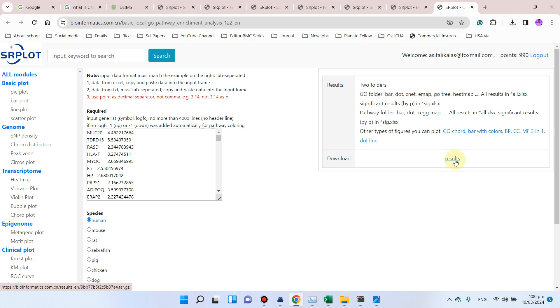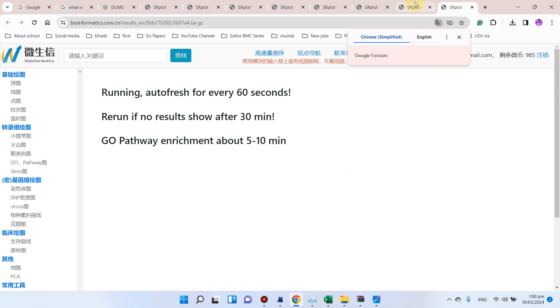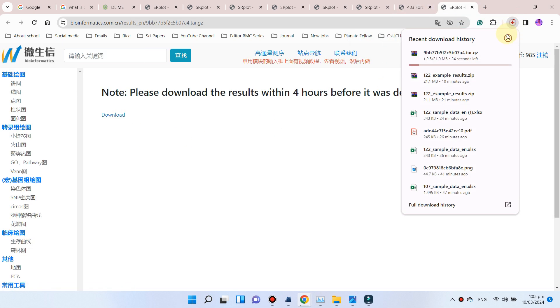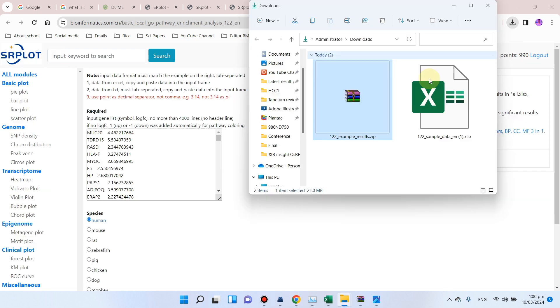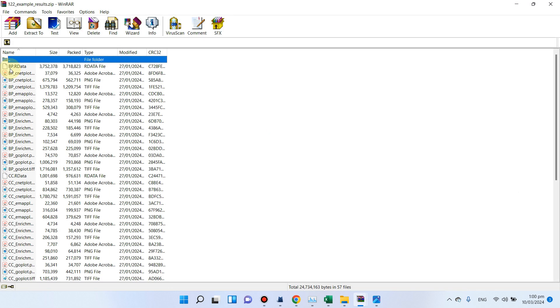So here you can see our results are ready to download, so you can simply click on these results. You can see this page will automatically refresh every 30 seconds, and you will get your results in the form of folder. You can see here we have two folders, one is Gene Ontology.